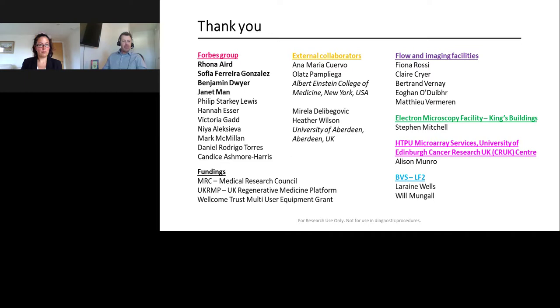So right off the bat, there's one technical question for you today, Lara. It's about your intracellular phospho-STAT3 stain. Can you explain how you were able to stain for phospho-STAT3 in some of the assay conditions? Yeah, sure.